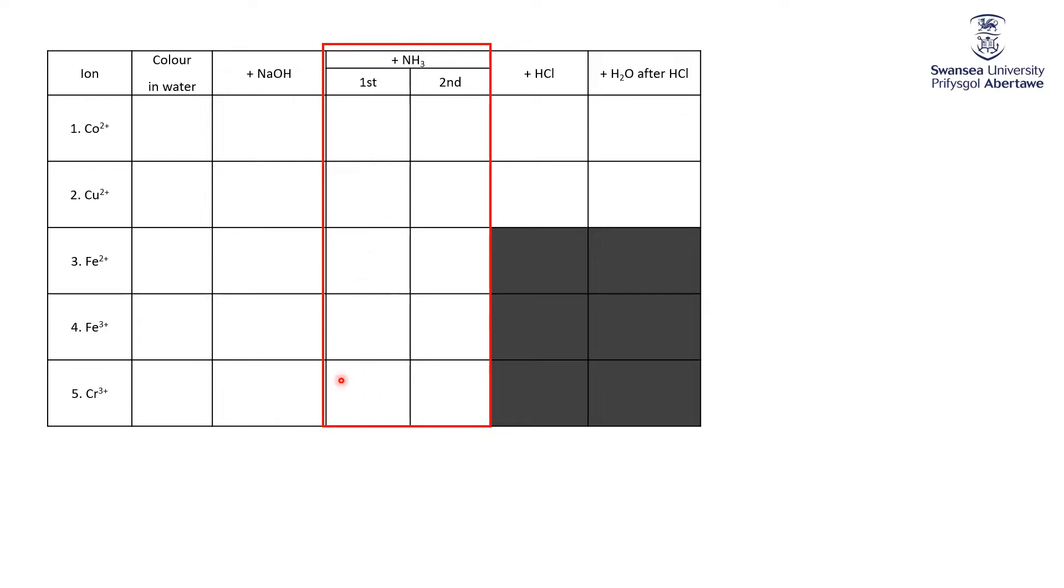So the first one in each case should have been the same result that you saw for the hydroxides, because all we're doing is essentially adding in a base, adding hydroxide. What's then interesting is when you keep adding ammonia to it. So that's the second addition of ammonia. Let's see what happens.